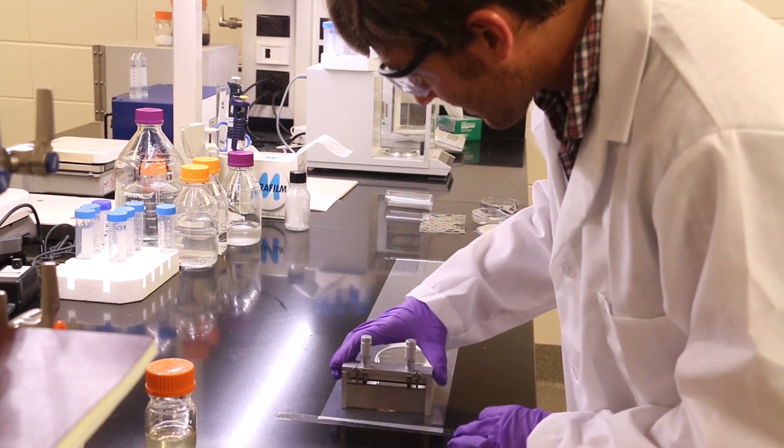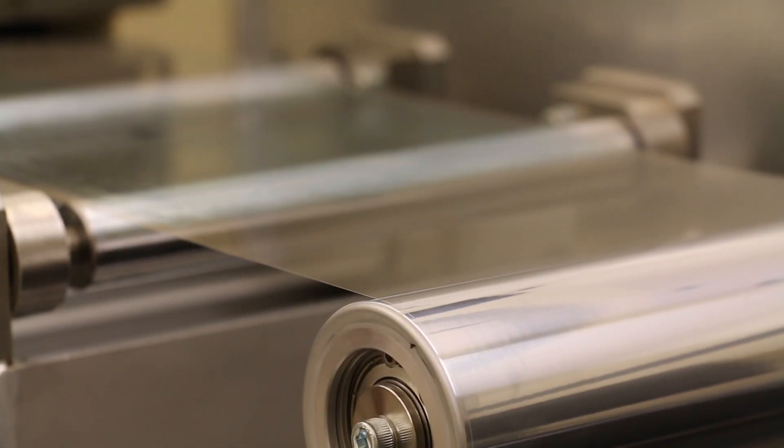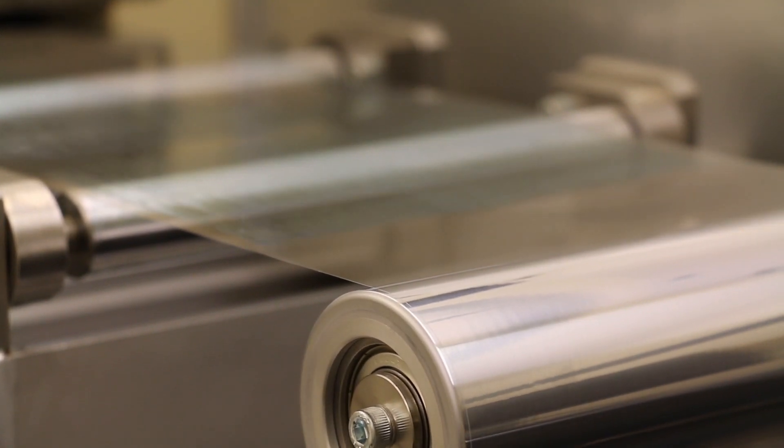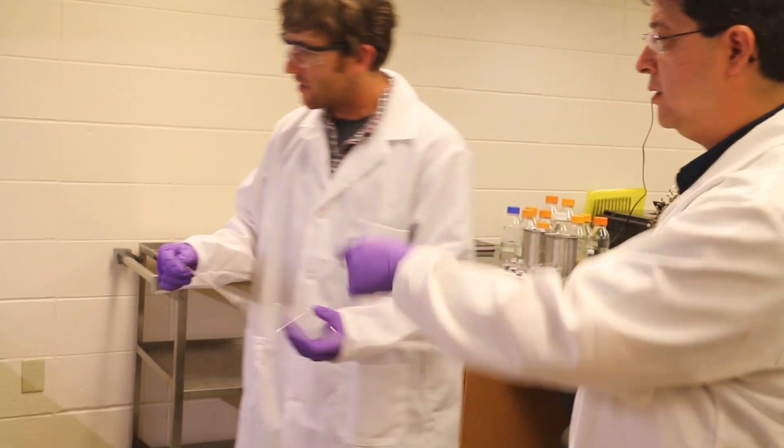We then move on to a film caster and cast on a substrate, which can then be directly transferred to small-scale manufacturing. The final film can then be cut into the final dosage form, depending on whether it's for pediatrics or adults.